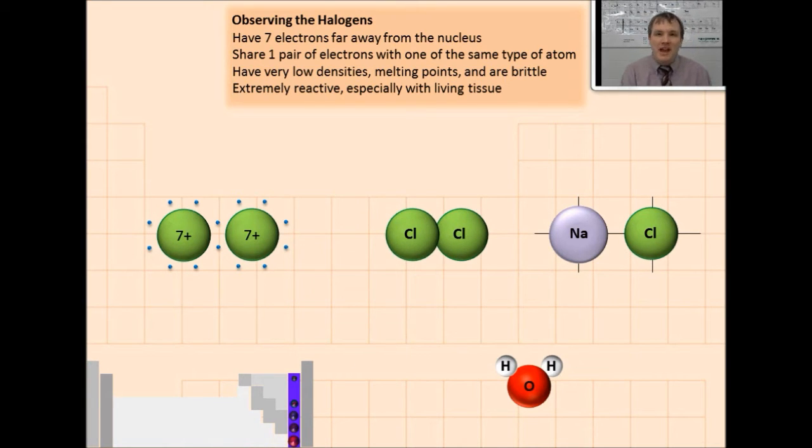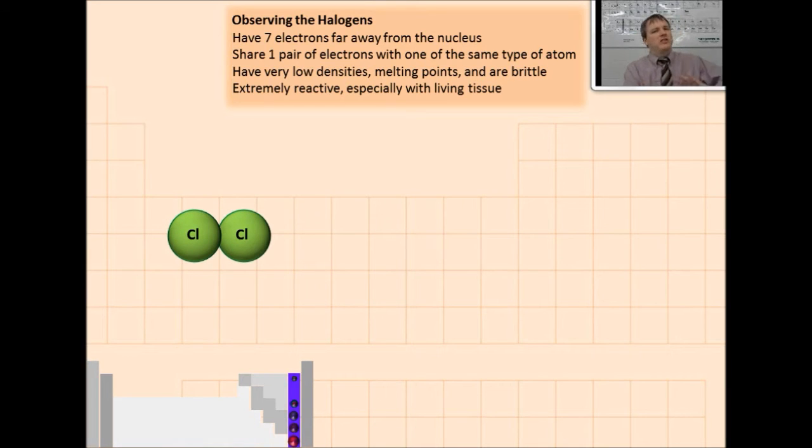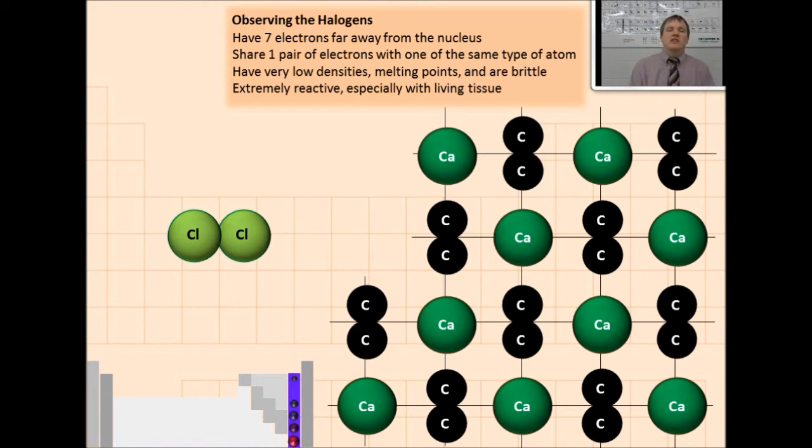This is the same as that Cl2 chlorine molecule we looked at before. Chlorine gas is extremely dangerous because even a small concentration can react with the tissues in your lungs and harm or kill you. So this is an extremely dangerous chemical reaction that we're going to be starting with. I'm going to put that chlorine on the side because that's just a part of the reaction. That's the halogen we're going to be observing. There's another substance that we're going to be using known as calcium carbide.